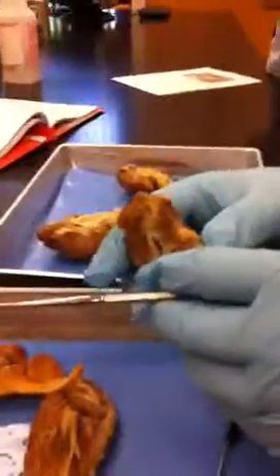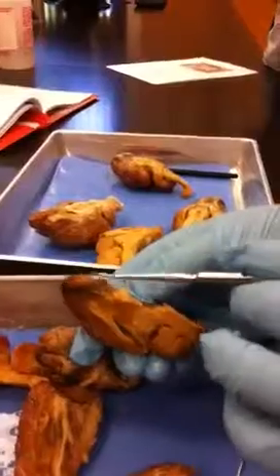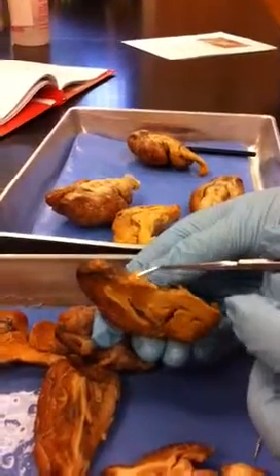You can see some on a sagittal too, I think. There's one. That's an olfactory bulb. That's an optic nerve right there.